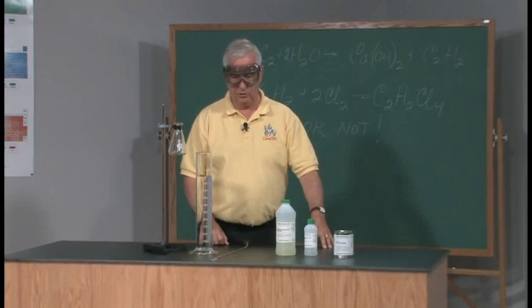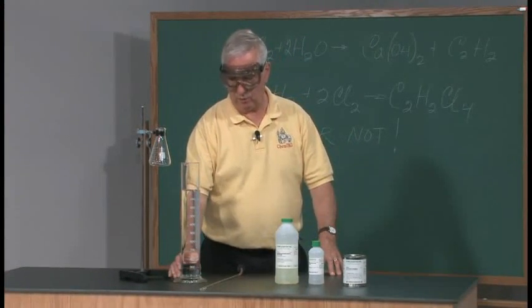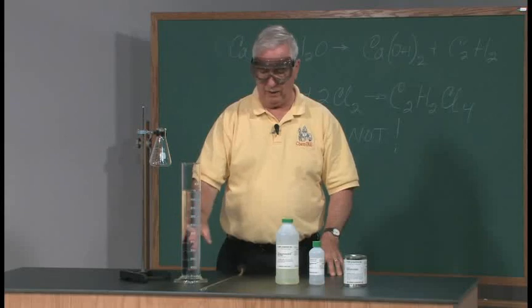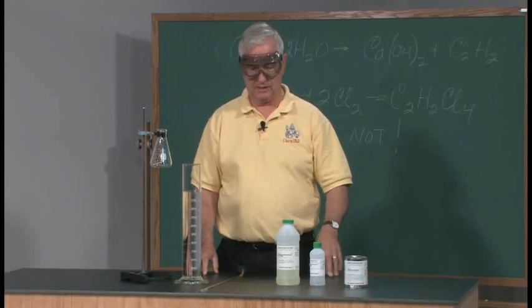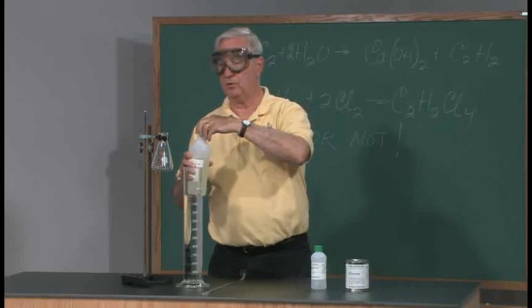What we do is generate acetylene in a cylinder of water. I have here one liter of water, and we generate chlorine gas from ordinary household bleach, sodium hypochlorite solution.